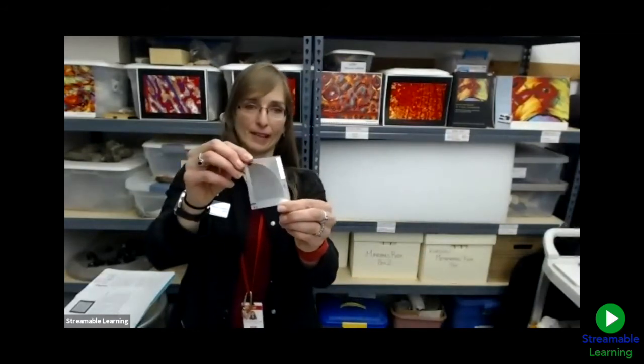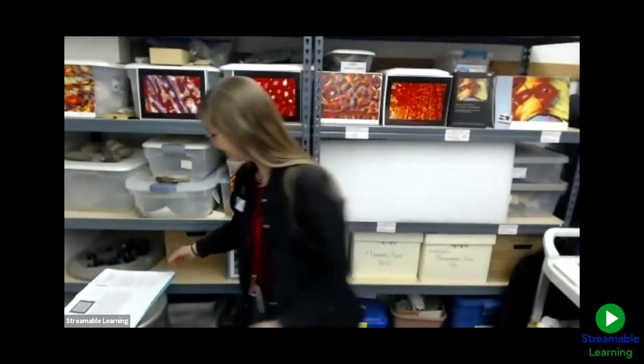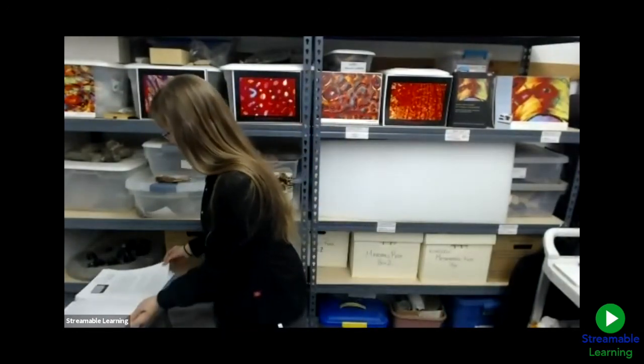Awesome. So Ellen Trace just asked us why we put that clear stuff around the fossil, that plastic resin. Why do you think, when she is making this fossil really thin, she put clear stuff around it first? Go ahead and type your answers into that chat box. You can just take a guess. And excellent. So now we're ready to look at some dinosaur bones under the microscope.